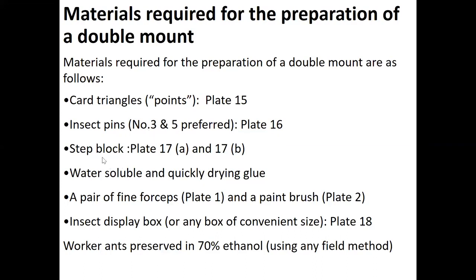Step blocks. You need a step block. Water soluble and quickly drying glue. A pair of fine forceps and a paintbrush. Insect display box. And worker ants preserved in 70% ethanol. As I said earlier, you collected them using any field method.